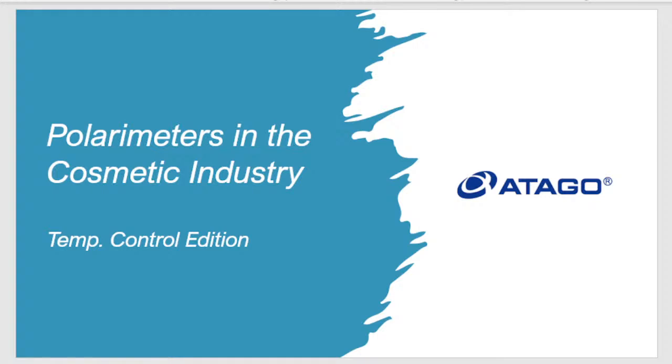Today we'll be speaking about the polarimeters in the cosmetic industry. This is the temperature controller edition, because we're going to touch on polarimeters in the cosmetic industry, but we're going to focus a bit more on the temperature control side of taking readings with the polarimeter. Okay.